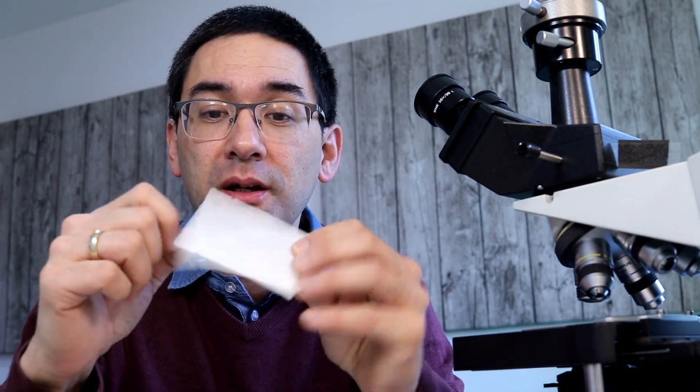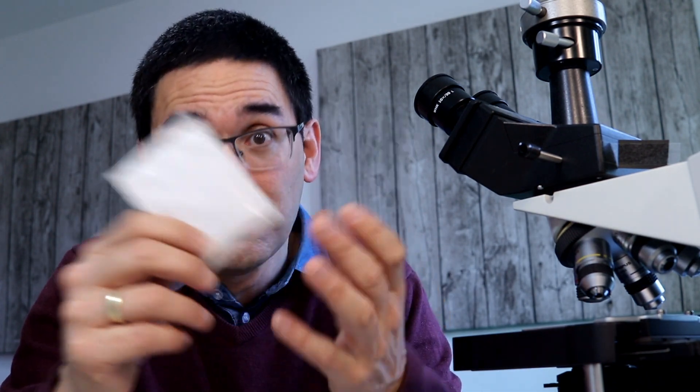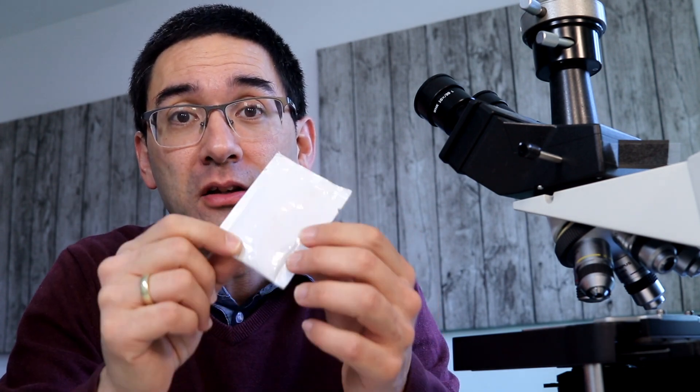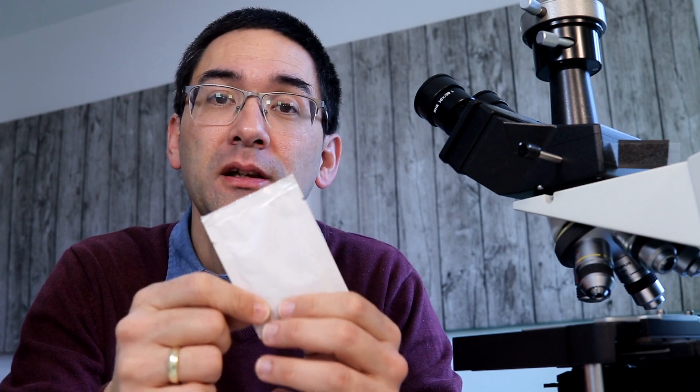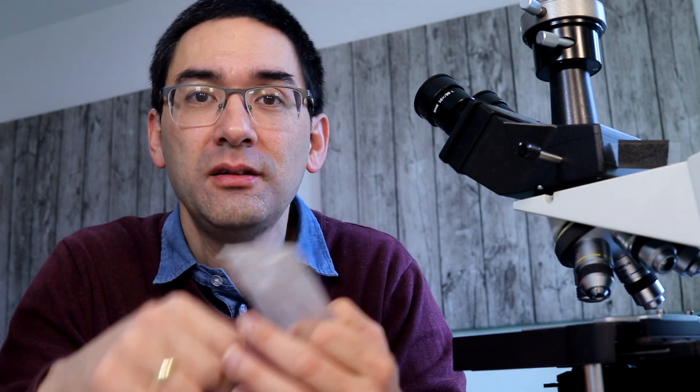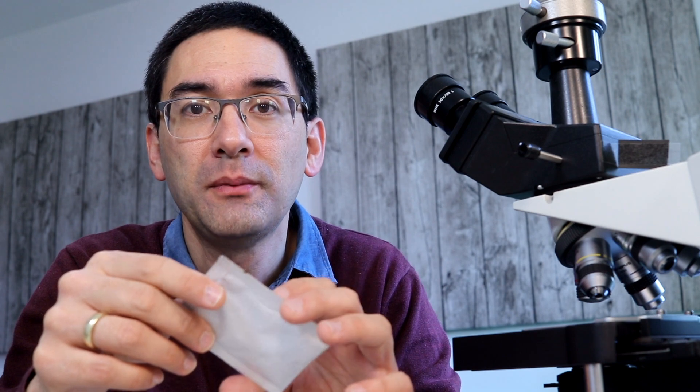However, it is also possible to use freezing to actually preserve bacteria. Look what I have here in this little sachet—you can buy this over Amazon or from other shops. There are yogurt bacteria in here and they are freeze-dried. This means that the bacteria were harvested in a centrifuge to remove the liquid, and then the bacteria were frozen and placed in a vacuum chamber to remove the water. That's called freeze-drying.